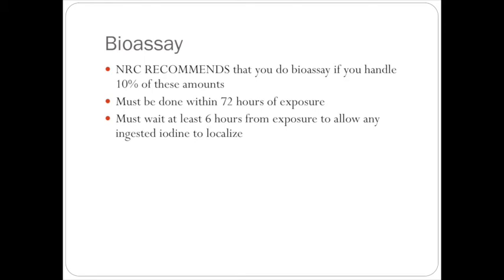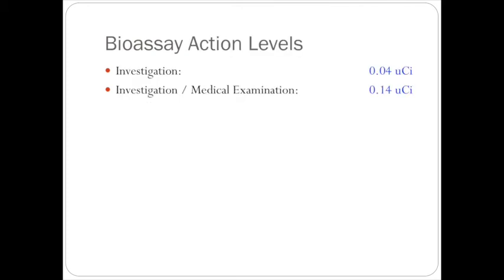The other stipulation of this, though, is that it has to be done within 72 hours of exposure. As I said, in my last job, we did iodine so much that basically we did it twice a week. And so by doing it twice a week, you very rarely were outside of the 72-hour limit. But if you only do one iodine a week, then you would set up your bioassay so that it was performed somewhere in the 72 hours after you actually made the capsule. And that meets your legal requirement. So again, this is one of those things that depends on the volume, how many iodine doses you do, things like that. You will set up your bioassay recommendations based on your particular pharmacy.